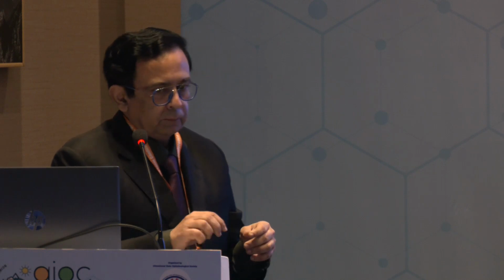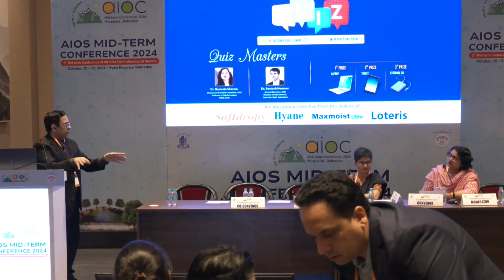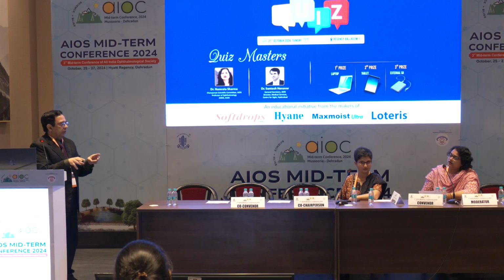Not like microbiology where everything needs to come in within a specified time. So no other medium like NS or RL? No, nothing like that, unless you want microbiology along with it. You divide the corneal button into microbiology, send it in saline, and the histopath in formalin. The only other media used is Michel's media or cold saline for direct immunofluorescence, for OCP and other cases. But otherwise everything else is formalin.